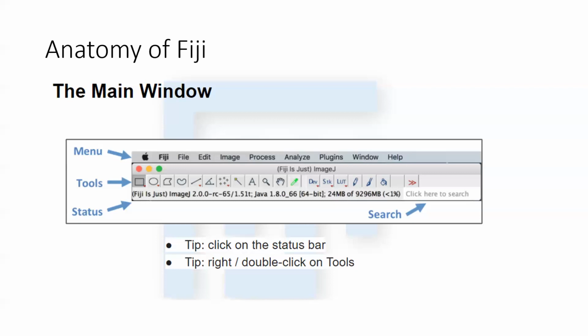So similarly with Fiji, ImageJ is just a backbone. Now, if you want to do a certain image operation, let's say open an image, you need a coffee pod which says open an image. So that's a plugin. That's a code. That's a macro. If you want to change the color of the image, which is essentially a lookup table, each lookup table is its own coffee pod that you put into the backbone of ImageJ, right?